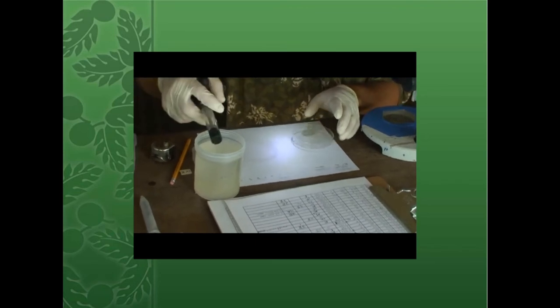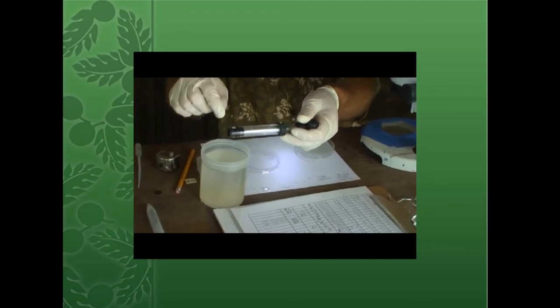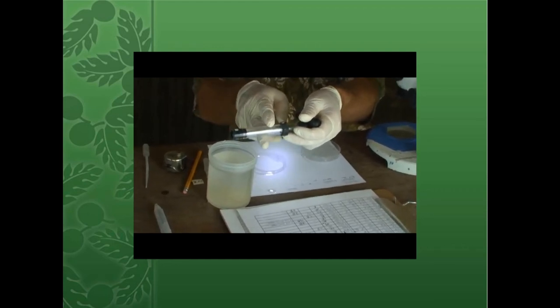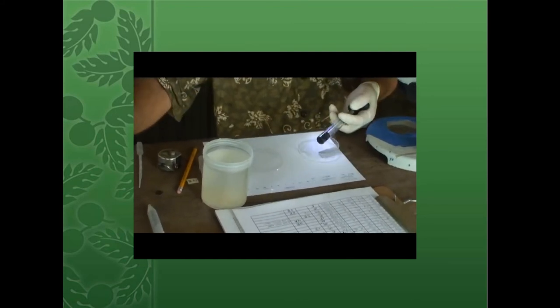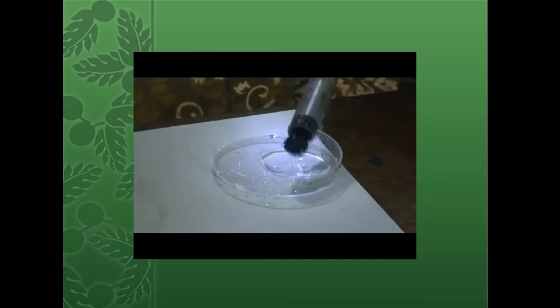Take another sample. Always watch to see if you've got a full sample in here. Sometimes something gets stuck in here and water leaks out, and you'll see bubbles in here. It's very obvious, or sometimes it all leaks out. So you got to make sure that that's completely filled with liquid on the inside. Again, taking it over here, letting it loose, washing any clinging eggs off.